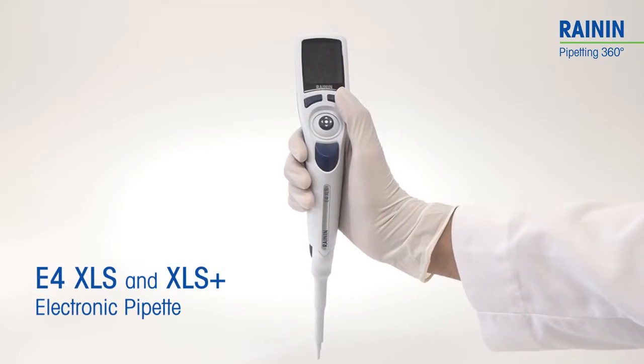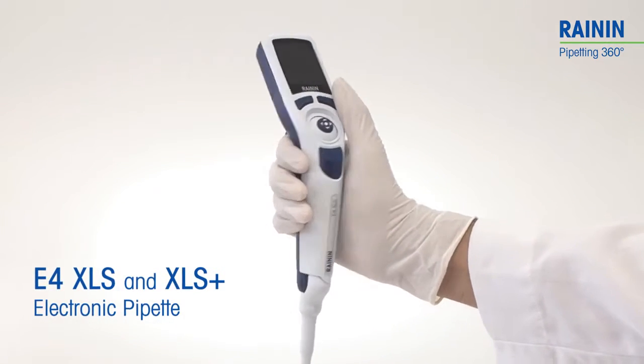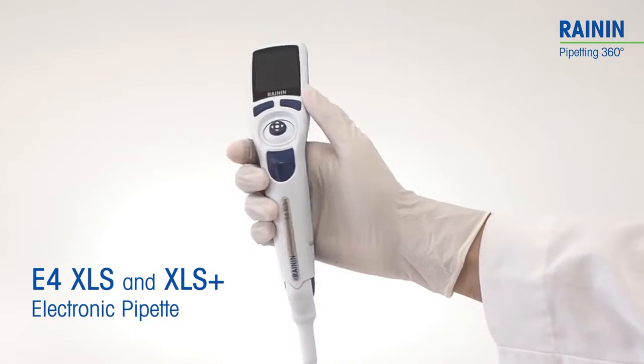Congratulations! You've just picked up a simple to use, highly capable pipette, the Rainin E4XLS and XLS Plus.